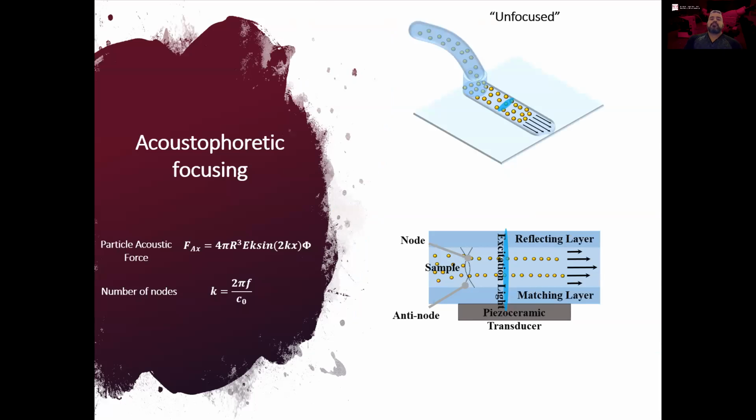I briefly mentioned earlier that you don't necessarily equate microfluidic devices to increased throughput, but Steve Graves' group over at Benubio have been able to show this. Using parallel acoustic streams, you're able to bypass the linear velocity limit seen with conventional hydrodynamic focusing flow cytometers. Theoretically, you can achieve up to 500,000 cells per second using acoustofluidic focusing.